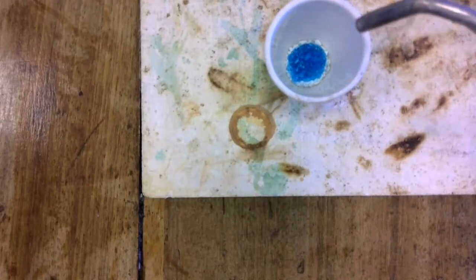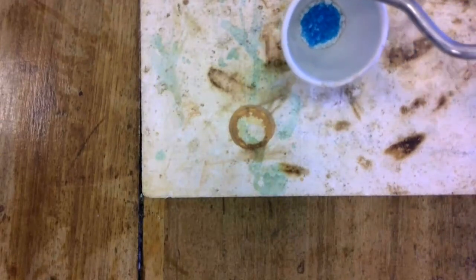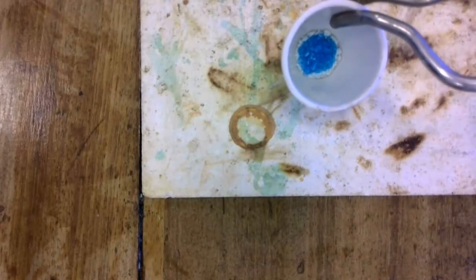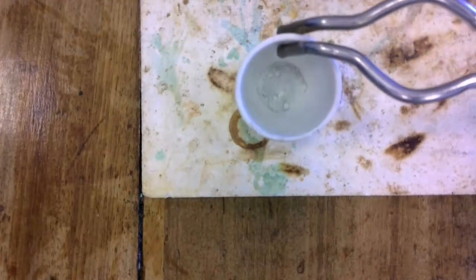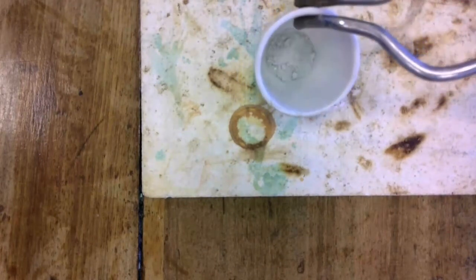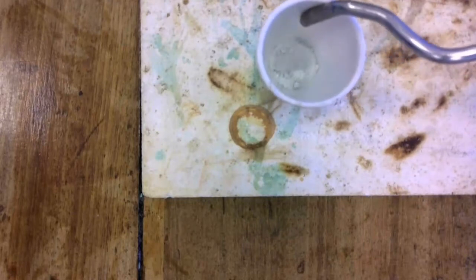You can see there I've been heating it for a few minutes and they're starting to turn white around the edges, showing that they're starting to lose their water. I've now finished heating them and they've turned into a white powder. So this is anhydrous copper sulfate.